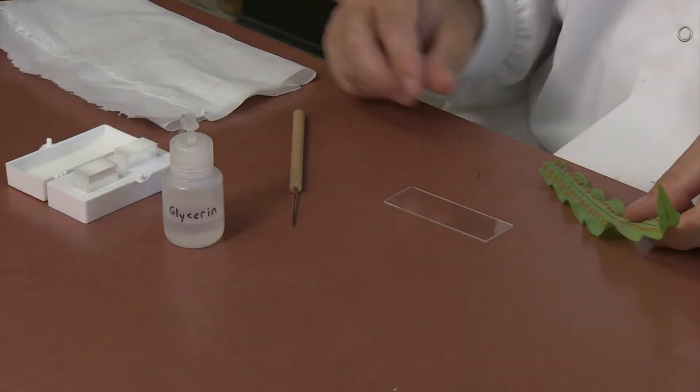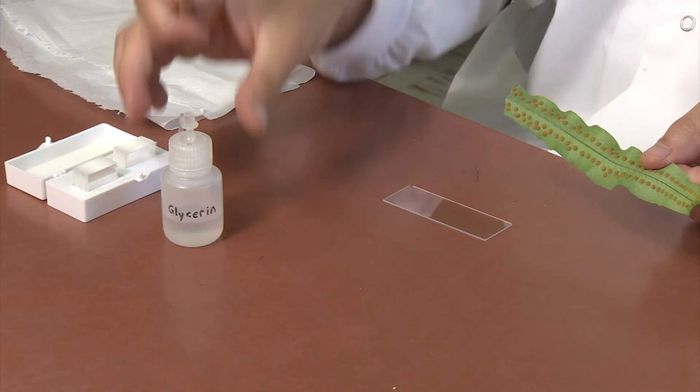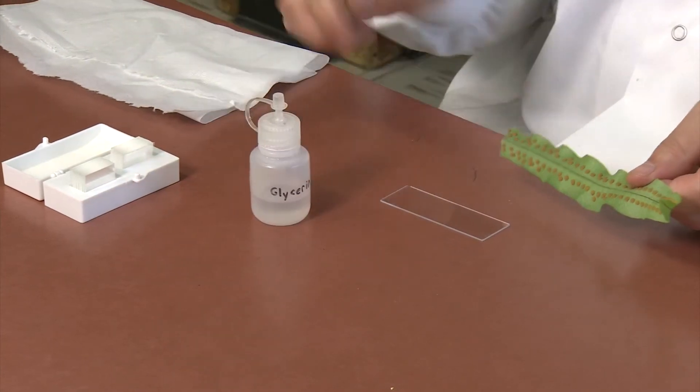In addition to slides and cover slips, you will need a fern frond with sorai, a dissecting needle, and glycerin provided at the side bench.